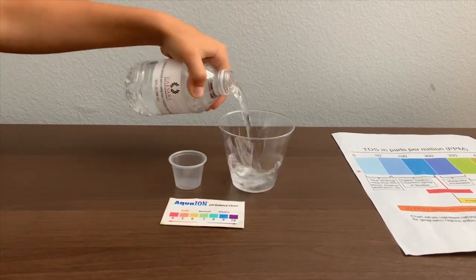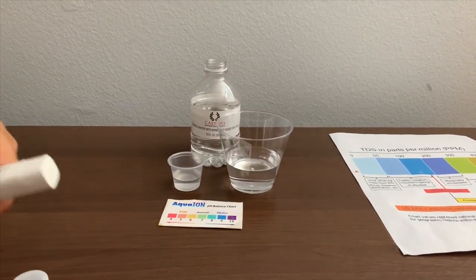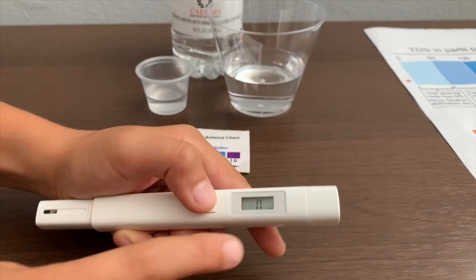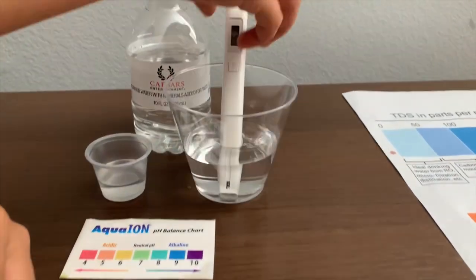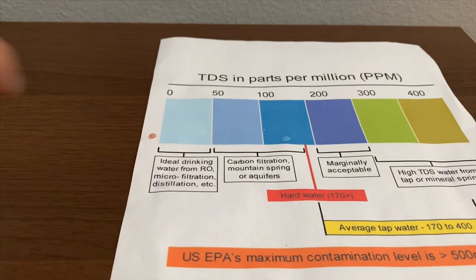Let's pour some water in. First, let's test the TDS level. If you want to buy this TDS tester, check the link down below. Turn on the TDS tester, make sure it says zero, and put it in. Twenty-two. That is microfiltered water.